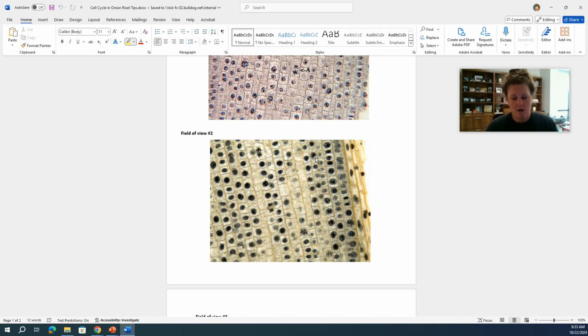And so in each one you can see that that nucleus is breaking down, and you can kind of see those chunkier chromosomes. So you're looking for a chunky broken nucleus, okay? All right, now the other ones are pretty easy to identify because they are very distinct.